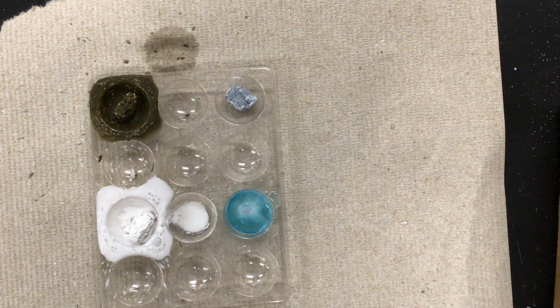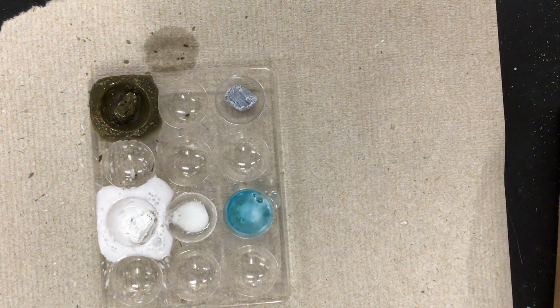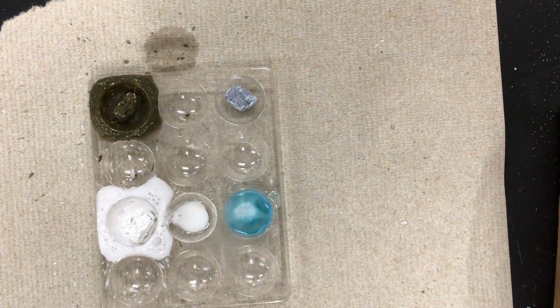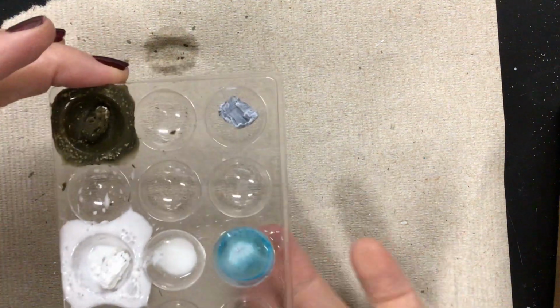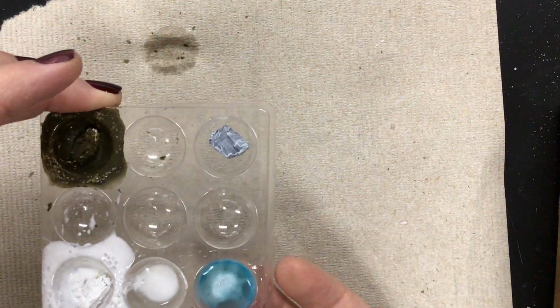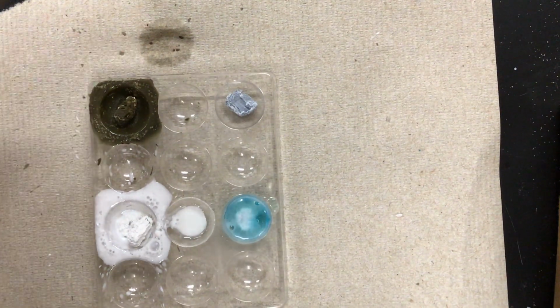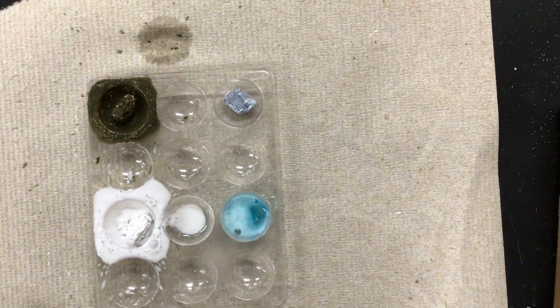Not quite as violent as the first two, but there's definitely some bubbles happening. So a gas is definitely being produced. Let me see if I can feel the bottom of this one. This one doesn't feel as warm as the first two, so I don't feel any change in energy on that one.